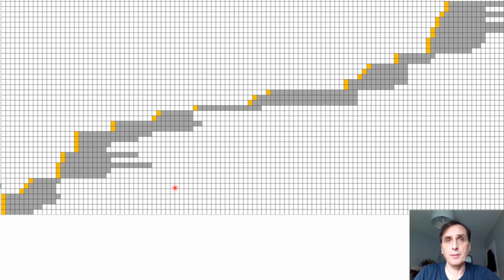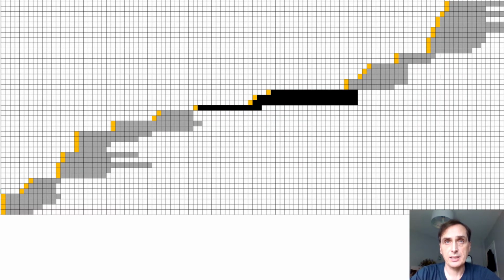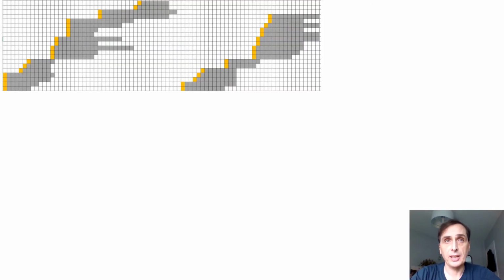So this is a zoomed in image of the peptide map, and I know from the occupancy score that these 4 central peptides yield very low scores, and so I can delete these in order to create 2 new subsections of data as shown here.